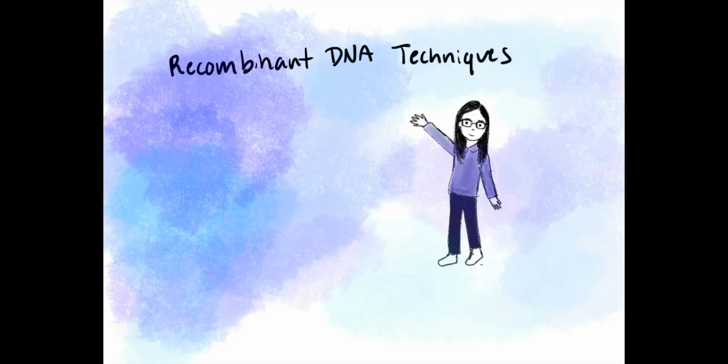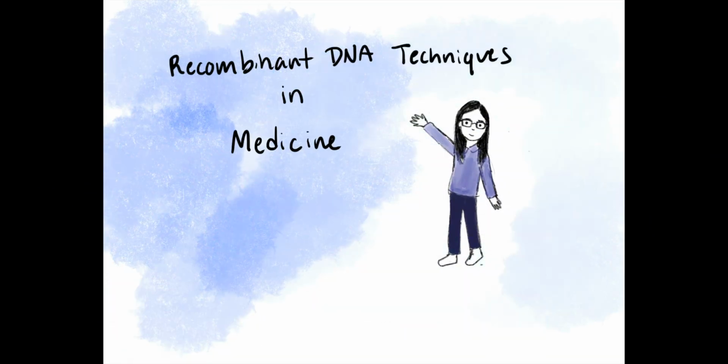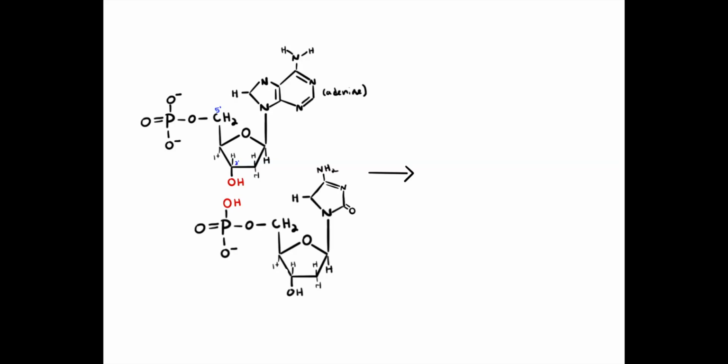And welcome to my presentation on recombinant DNA techniques in medicine. So I'm first going to talk about Sanger sequencing.